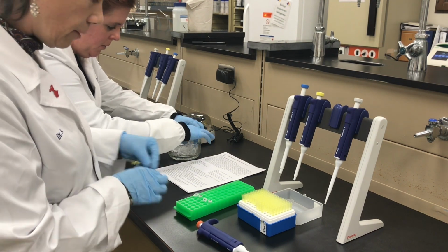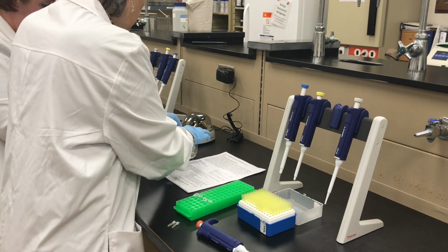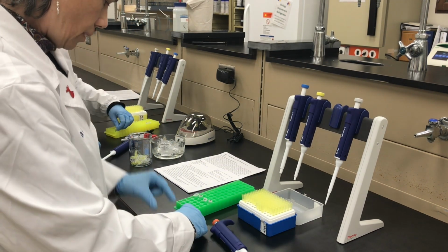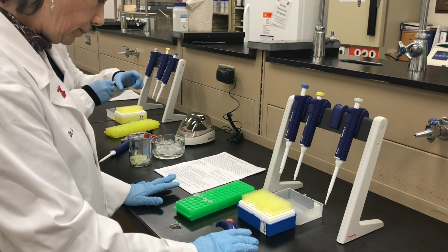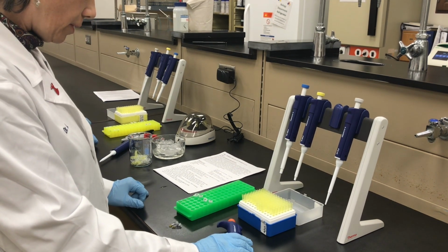So if I pull out these are my triangles. Oh, the other thing is don't put the tiny little tubes in the rack. They're hard to get out. Maybe harder for some people than others. So triangles are on this side. Tube 1 will be the sample.